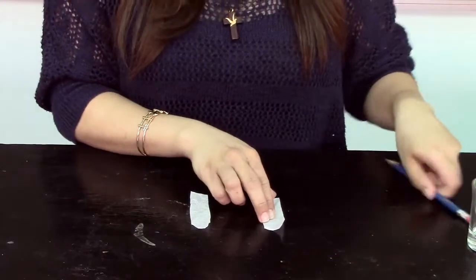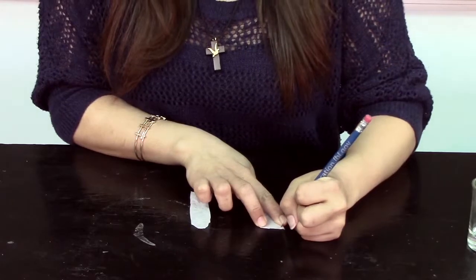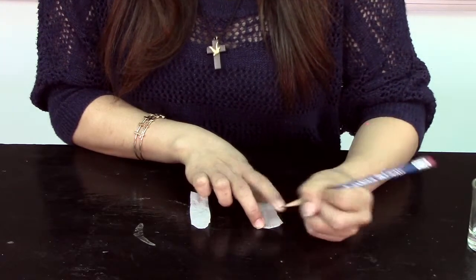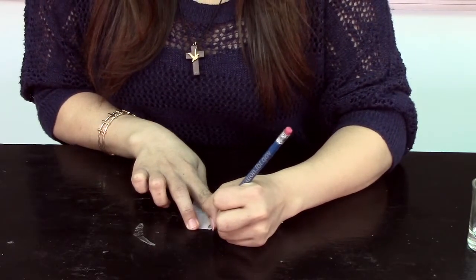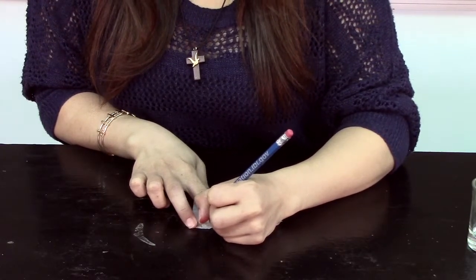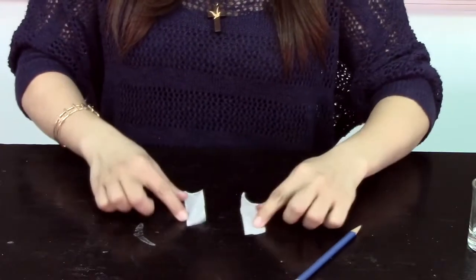So you want to take your coffee filter strips and write at the top in pencil the candy you're going to be using the strip for. So we're going to write in pencil because we don't want pen ink to interfere with our experiment. And we just have them labeled like so.